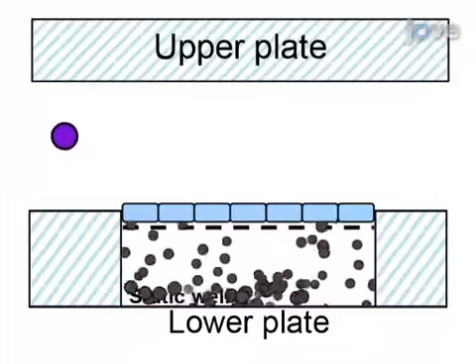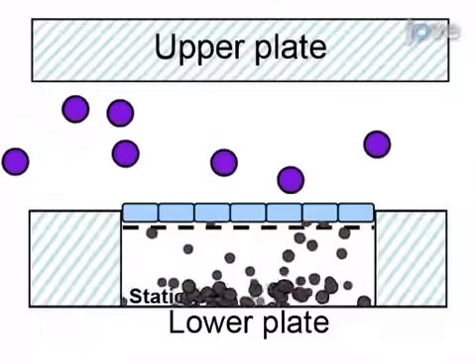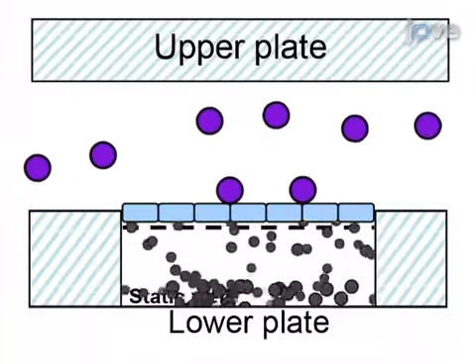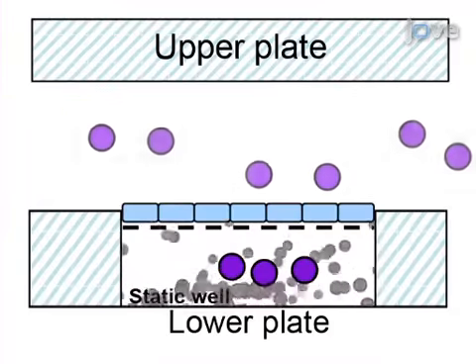As a second step, test cells of interest, such as leukocytes, stem cells, or tumor cells, are allowed to circulate in the 3D system. During circulation, the contents in the static compartment influence the efficiency of interactions between circulating cells and endothelial cells, and subsequently the rate of transmigration of the test cells across the endothelial layer.